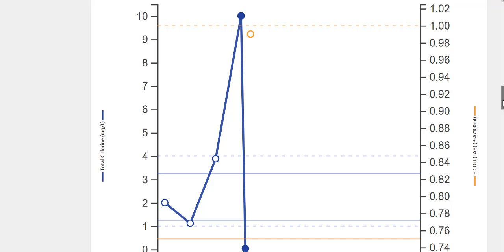Going down below, I can see these new criteria and alert ranges. Again, if I hover my mouse over the ranges, I will see that range. Here I can see the alert max that's set at the measurement level, and if I hover down below, I can also see the criteria max for the other measurement. If I hover my mouse over the circles, I can tell the results.